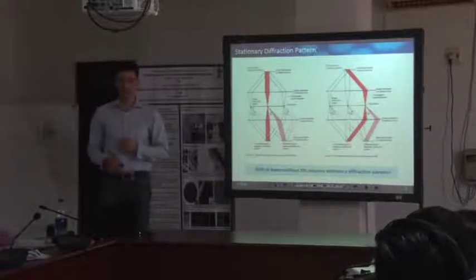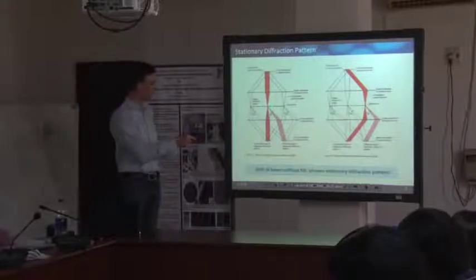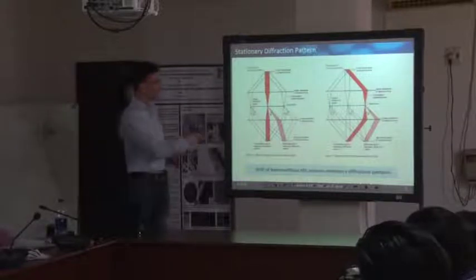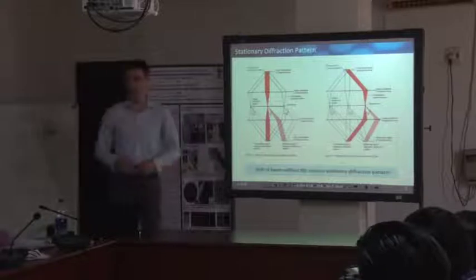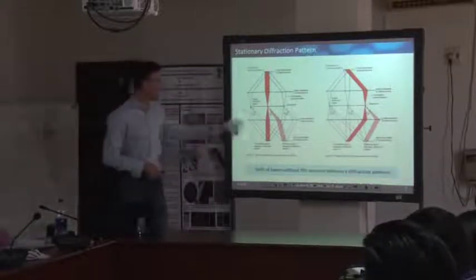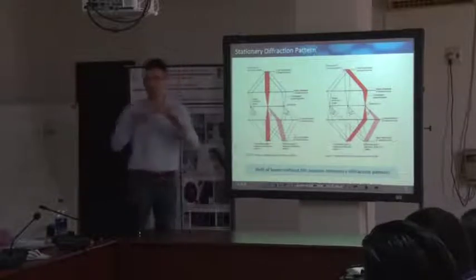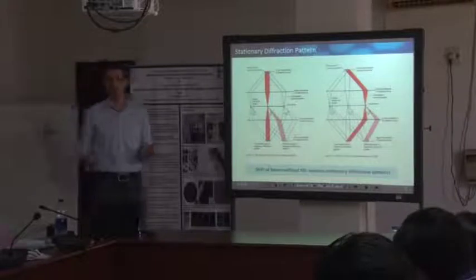We don't want to have that in our transmission electron microscope. In our transmission electron microscope, so this is our sample, what we want to have is an electron beam that always hits our sample at 90 degrees. Meaning that this path through the sample is always of the same length for a plane parallel sample, okay? Because this is beneficial for spectroscopic analysis.